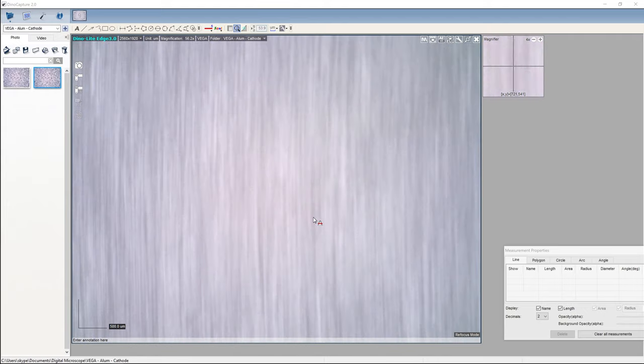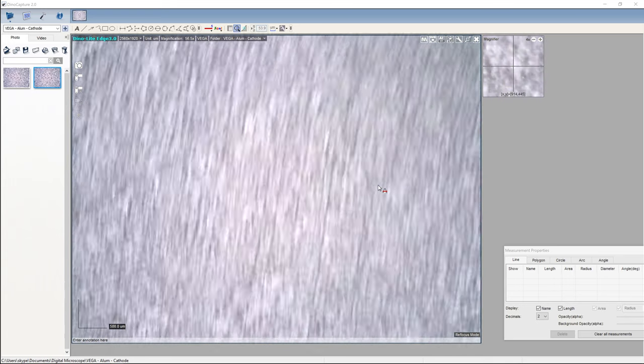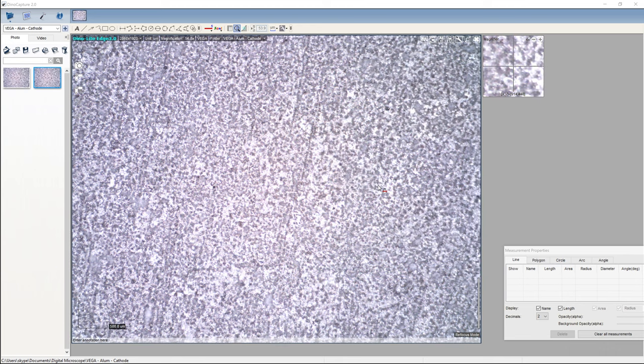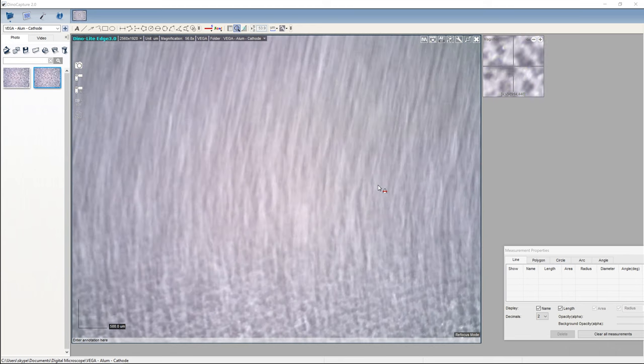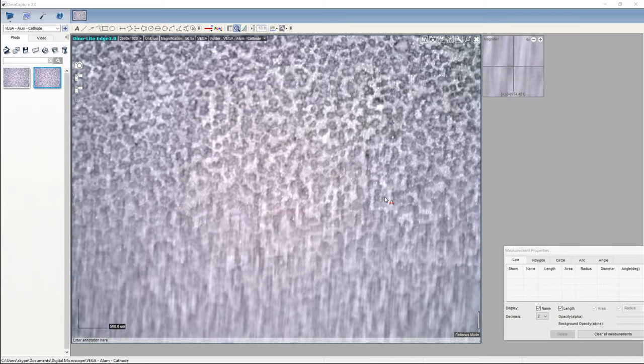And as we get to the edge here, a little out of focus, we'll get that back into focus. You can see they're much smaller down this end. And in fact, they kind of peter out. Okay, so they're still there, but they are much smaller. And if we go back to the center where they are bigger, somewhere here, you can see they're bigger here.